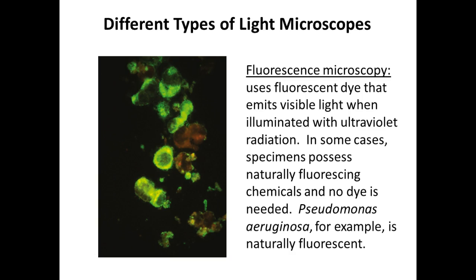And then scientists use a lot of dyes nowadays that fluoresce, where they can label different parts of organisms and observe that under the microscope. And I have a beautiful poster in my office. It shows all the different fluorescent dyes and different pictures that microbiologists have taken of labeled specimens with fluorescent dyes. This type of microscopy obviously uses UV light and special filters. You can't look at UV light, you'll damage your eyes.